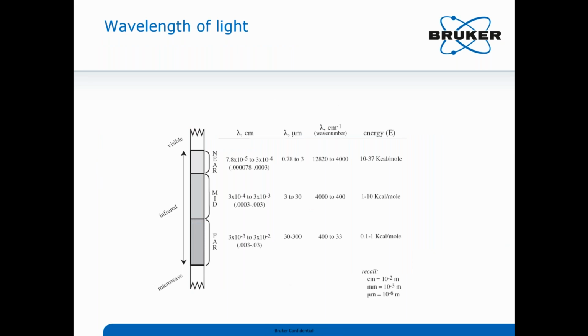Why the middle infrared region of the electromagnetic spectrum? So when we look at the mid-IR, this is where we're looking here. And you can say, okay, I go to the near infrared by going higher in energy, or to the visible and to the UV and X-rays. In the other direction, you go to the far infrared, microwaves and radio waves. And in the chemist world, we're doing 4,000 to 400 wave numbers, and in the physicist world, that's 3 to 30 microns. That's where the ground state to the first excited state vibrationally, those transitions are. Whether you're accessing them by Raman or IR, that's the region you're going to look.